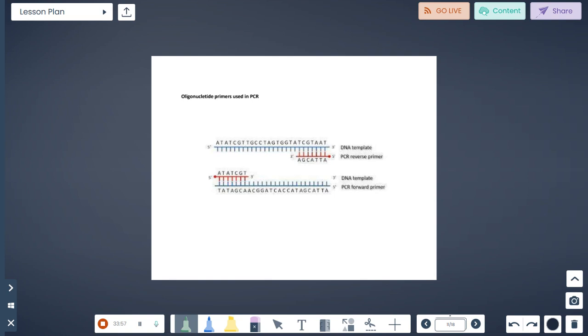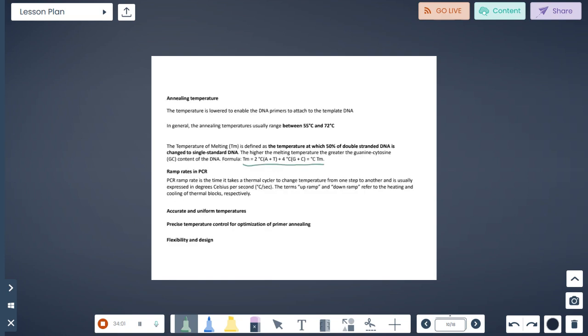Some PCR machines, when you check, you can also see a lid over it, a heated lid. So that is actually helping with evaporation loss. Initially, when we were using the PCR reaction, there was no heated lid, so we used mineral oil. When we use mineral oil, you have to set a large PCR solution for the reaction. You cannot set smaller reactions.